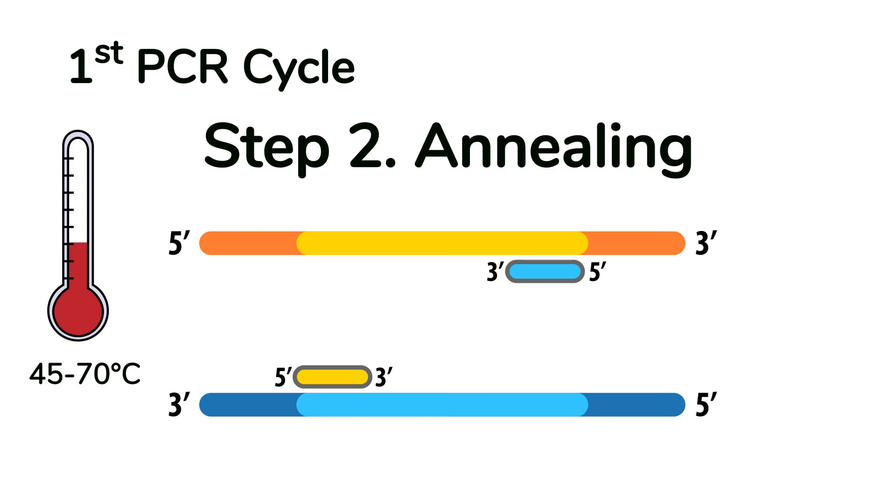The short primers base pair to the template with great specificity so that two template primer complexes are formed. Primers are supplied in great excess and will not be depleted during the PCR reaction.